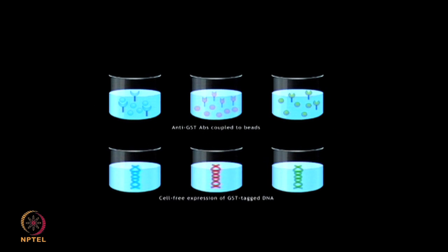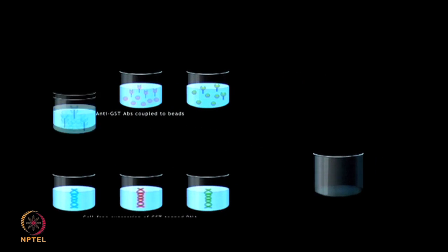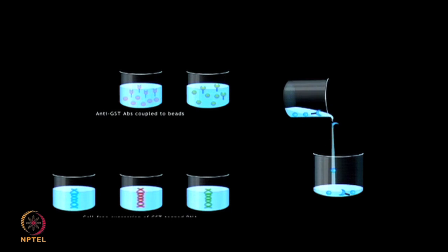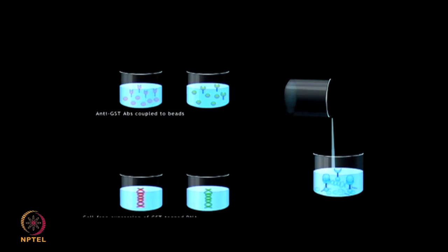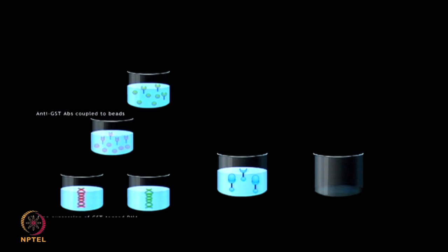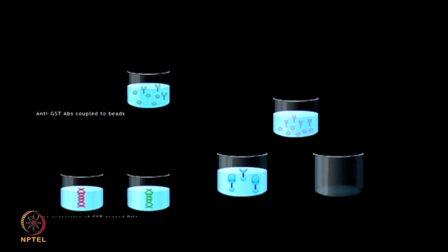In this study, authors developed a programmable multiplexed immunoassay where tagged antigens were expressed by using in vitro transcription and translation, and captured these onto the anti-tag coated beads.